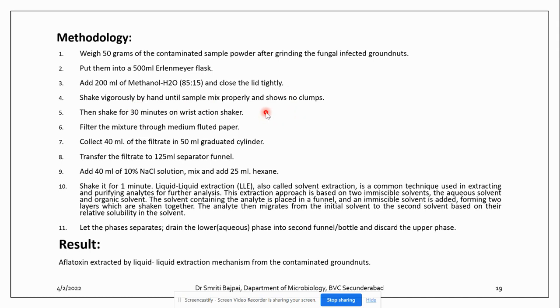We shake the flask vigorously by hand until the sample mixes properly with no clumps, then keep it on a rotary shaker for thorough mixing. Then we filter the mixture through medium fluted paper and collect 40 ml of the filtrate, which is transferred to a separatory funnel. This is a liquid-liquid extraction technique, also called solvent extraction — a common technique used in the extraction and purification of analytes for further analysis.